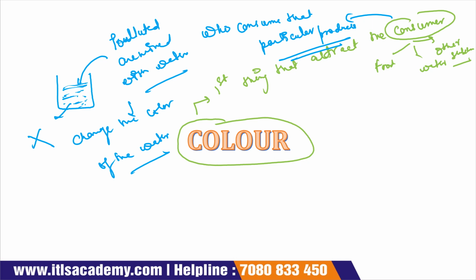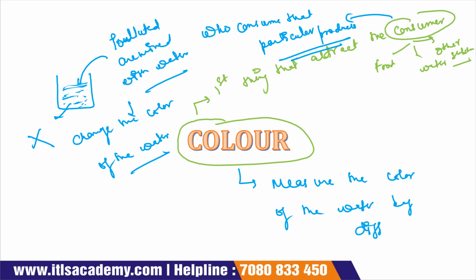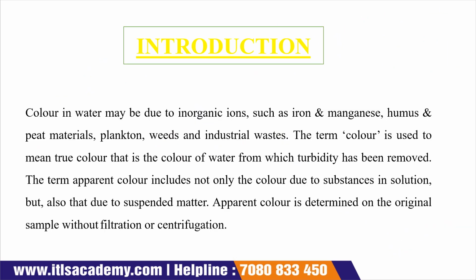So in today's lecture we are going to see how we measure the color of the water by different methods. But first, before discussing the methods of color measurement, we are going to see the introduction to color in water.